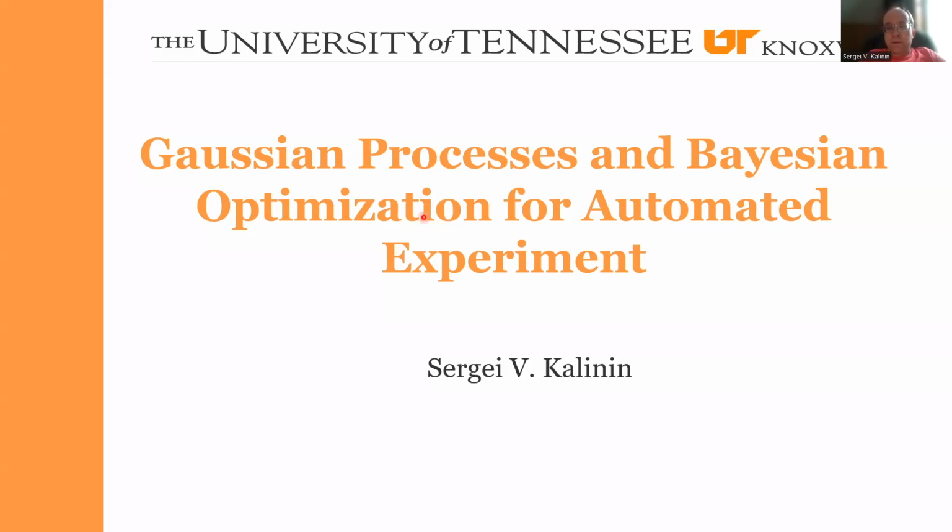So that has been quite a few lectures on the quantification of electron microscopy and on the use of deep convolutional networks for image analysis in EM. So today we are starting the third part of the course, where we are going to talk about decision making and generally incorporation of the automatization experiment in the electron microscopy workflow.